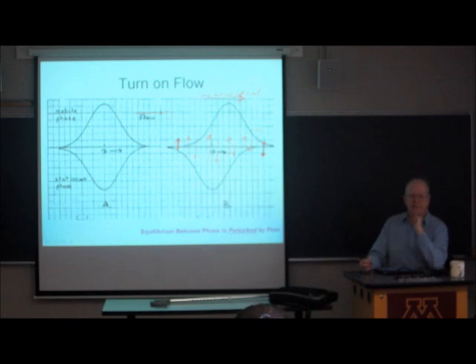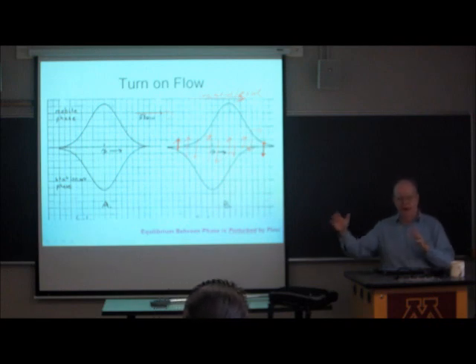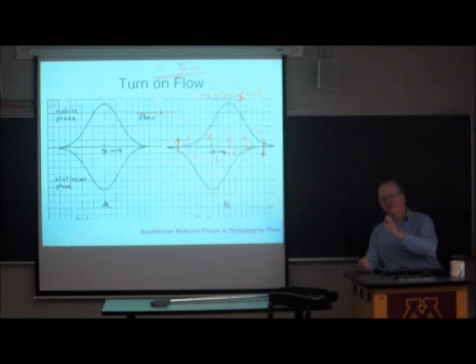So that's one process. Now, if I make the flow rate higher, or if I make the linear velocity along in the axial direction higher, is this going to cause the HETP to go up or to go down? You're going to cause the peak to get wider or narrower? Going to get wider. This is the C term. Because it gets worse, it gets bigger as you increase the velocity.